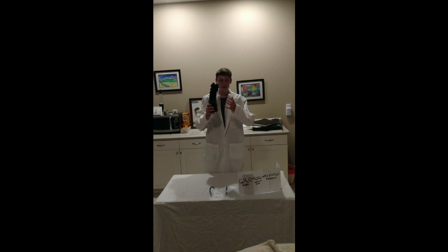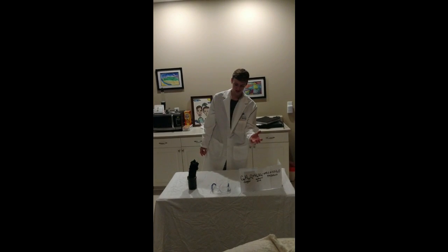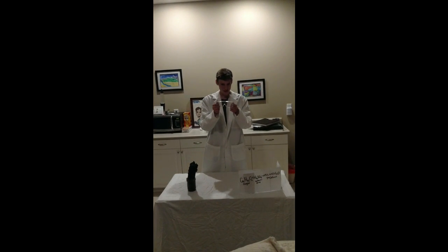This is the product that we ended up with from the sulfuric acid and sugar experiment. This is the chemical formula and equation. Always wear your safety gear, kids.